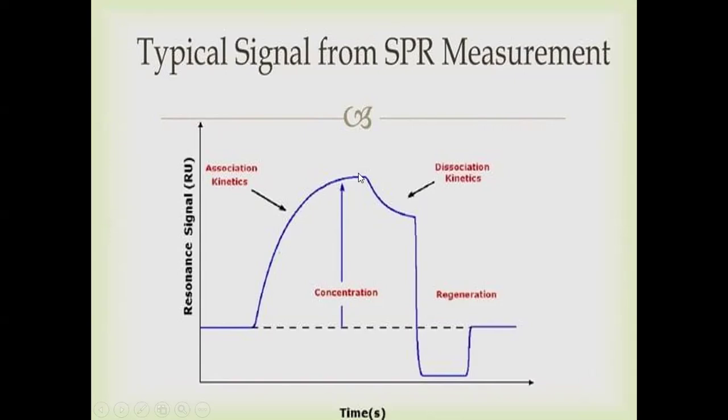Beyond a certain point, there will be a dissociation. Next time, when you are using the same sensor, the sensor should be dissociated from the contact material and can be reused. During the regeneration, you can see that the signal comes back to 0, telling that the sensor is ready for the next usage. As they are made of pure metals, the sensors are usually not one-time usage; they have to be reused. That's why you need to look at the dissociation kinetics too.